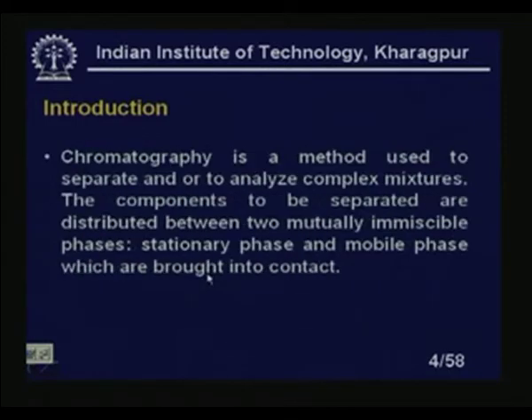Introduction. Chromatography is a method used to separate or to analyze complex mixtures. The components to be separated are distributed between two mutually immiscible phases, the stationary phase and the mobile phase, which are brought into contact. These terms we will refer to very frequently throughout this lesson, that is, the stationary phase and the mobile phase.